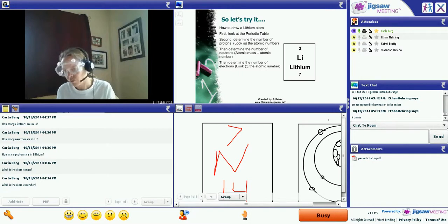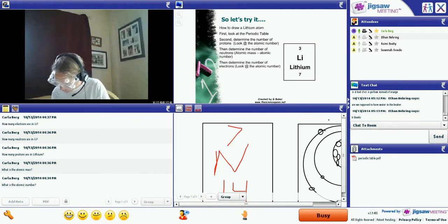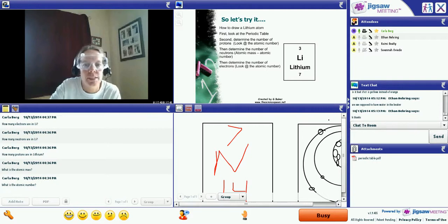So let's take a look at your wells for Part B. It's now been 8 minutes on mine. And I can see precipitates forming. Remember, the best way to do that is to look from the side at your wells. Okay, and I'm going to do the same thing. I'm going to send you a poll. This time we don't have brownish color. We just can see a white precipitate on the bottom.